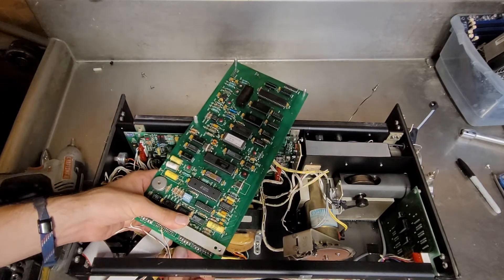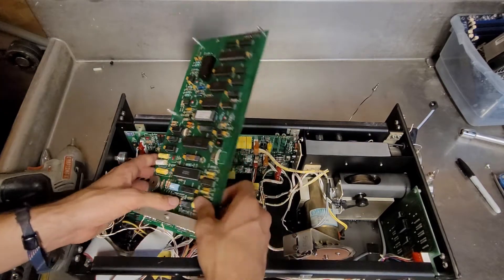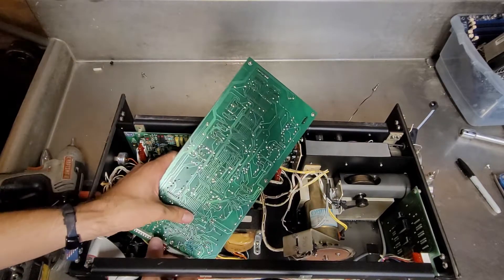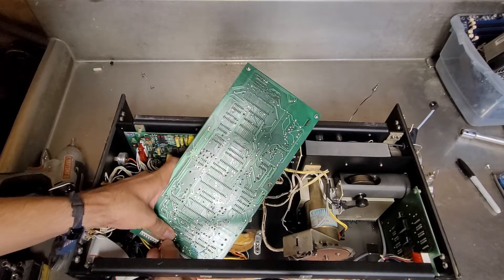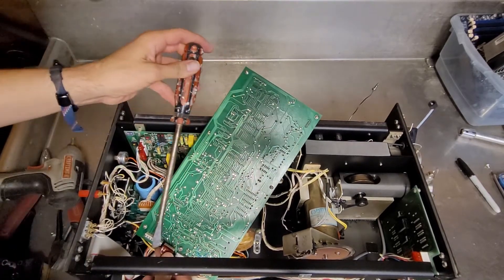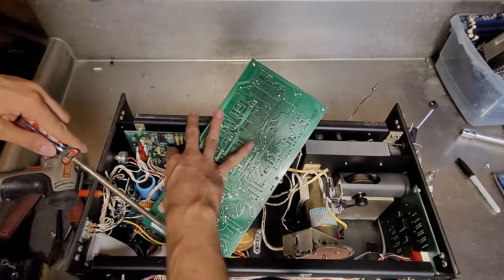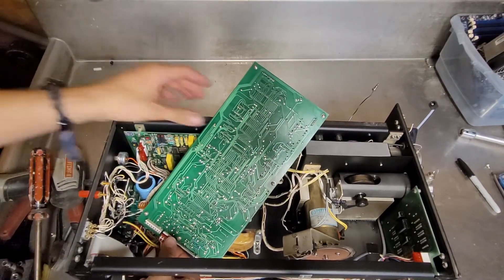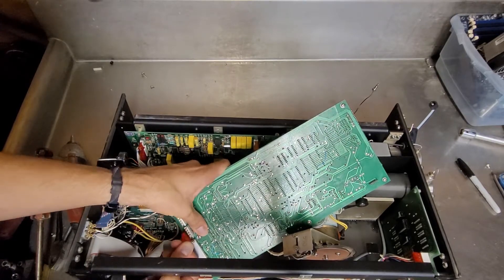Oh my goodness, it's on there tight. I cut my finger open on something. Won't be the first time. Luckily my tetanus is up to date. Gotta be an easy way to do this that doesn't involve cutting my fingers open. There we go.